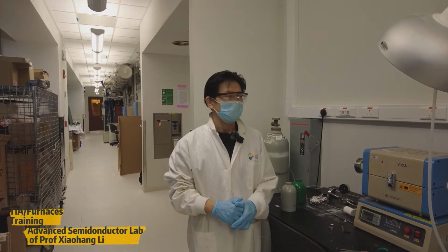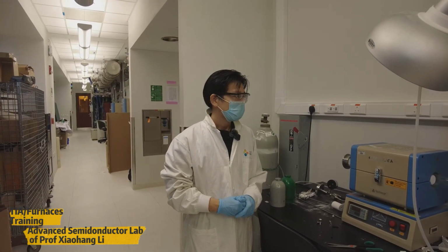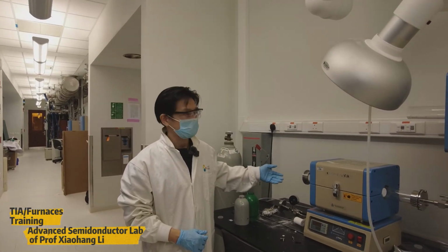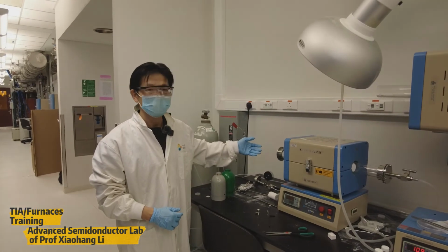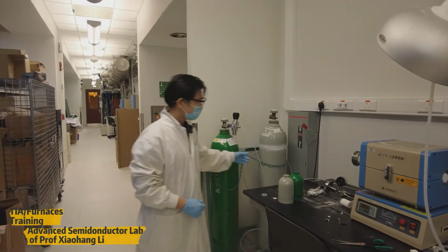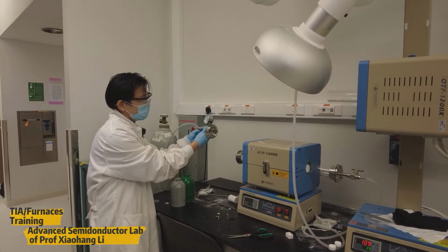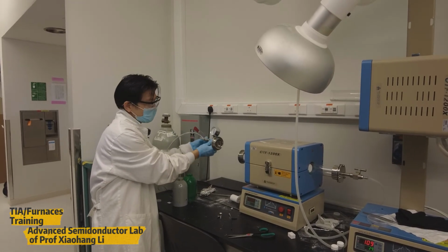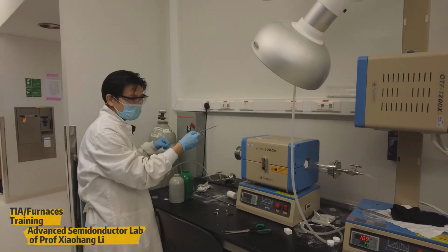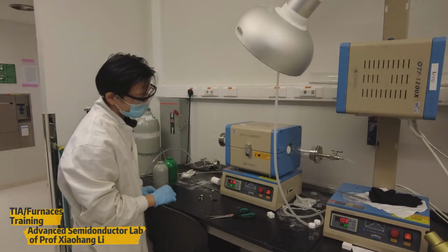If you want to anneal with a certain gas, we have to go to this tube furnace to do this kind of experiment. You can prepare your gas cylinders and connect to the flange. There's a gas pressure gauge here, and you can put your sample inside with this rod, and then start the power.